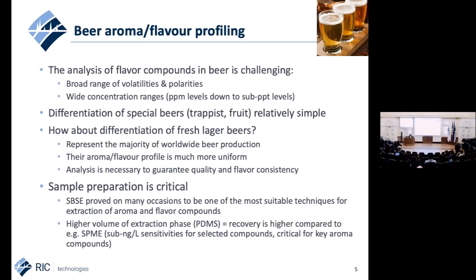But this analysis of lager beer is just as important as it is for any other type of beer, because the producers need to be able to guarantee quality and also consistency, flavor consistency, batch to batch, year to year, and so on, right?